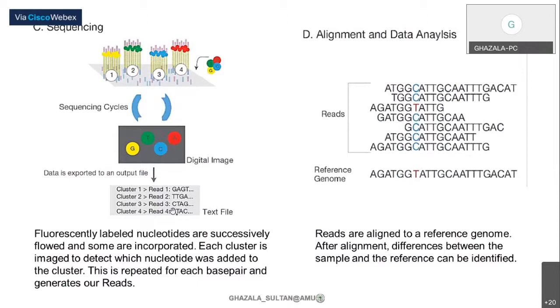Once the sequencing is done from the sequencer, we get the results in FASTQ file format in the form of reads, which means the nucleotide sequences, which will be available in FASTQ files. We were checking in the NCBI database how we can get these sequenced files from the database, which is NCBI, which we are using majorly.